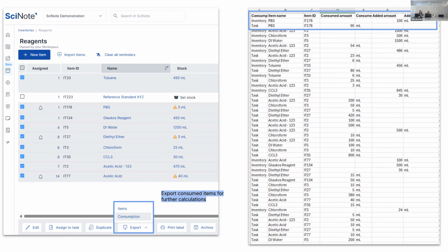Next thing, after you create those items, what you can also do, and this is available on this right side, you can see what we call the item card, and this is what carries all the information for a specific item, for a specific sample. And there is a block here under relationships. So let's say you were creating aliquots, you can now create parent and children relationships, or if you're working with cell lines, you can always trace back where a specific sample came from.